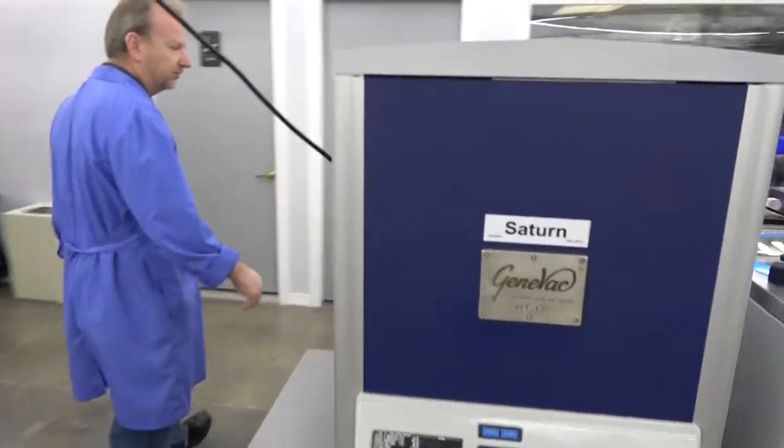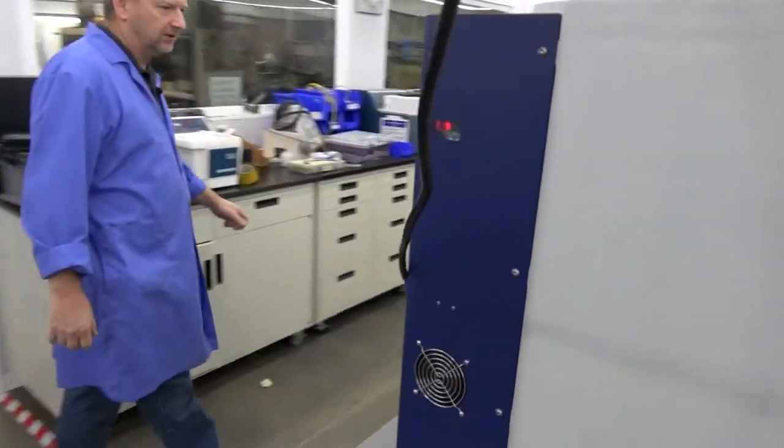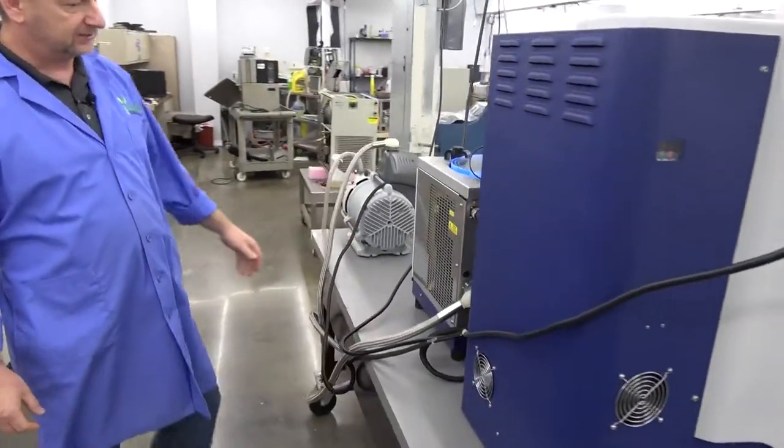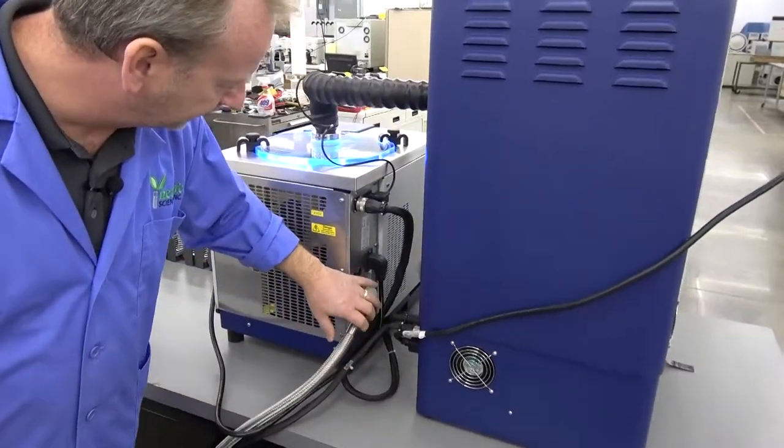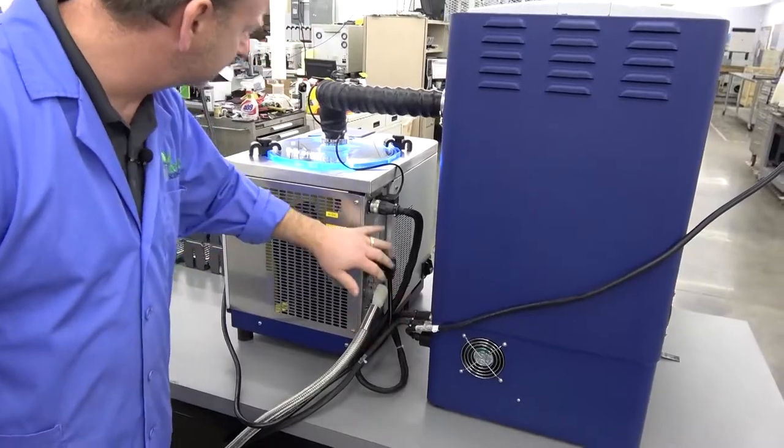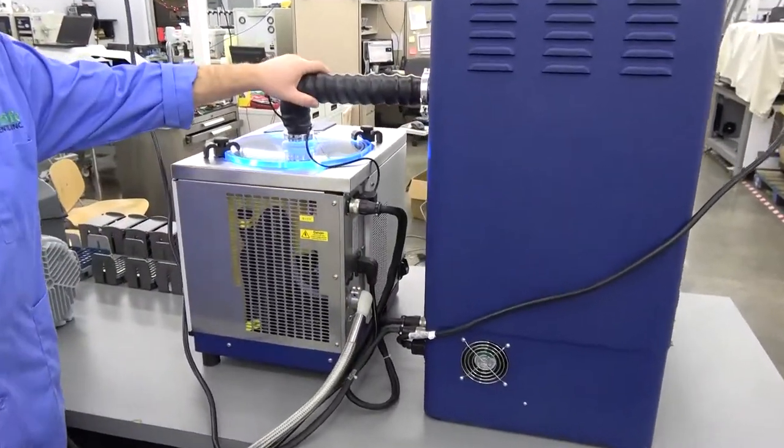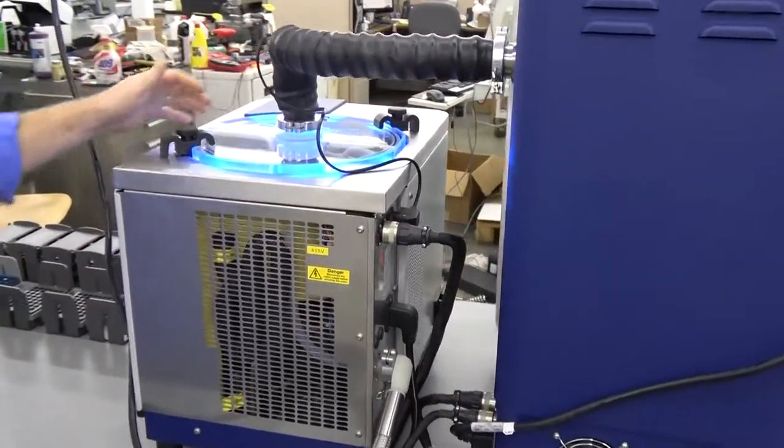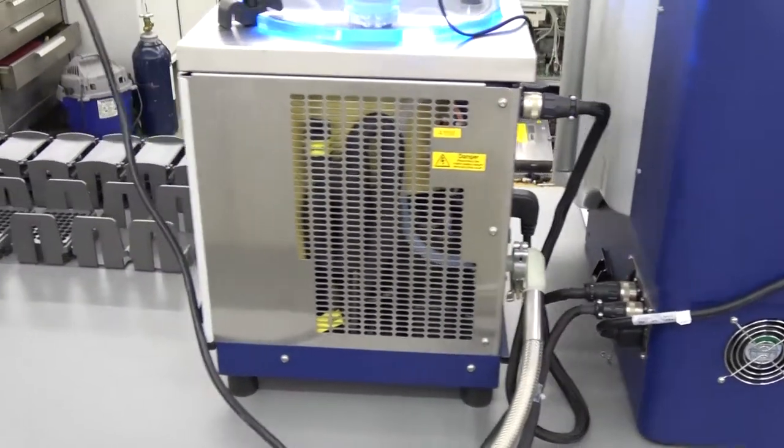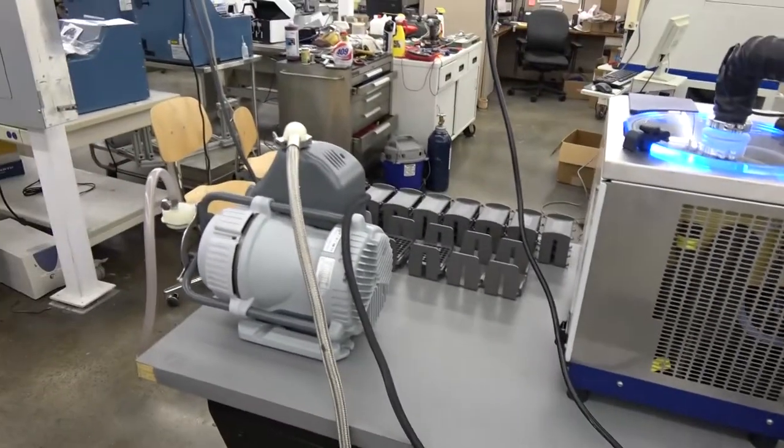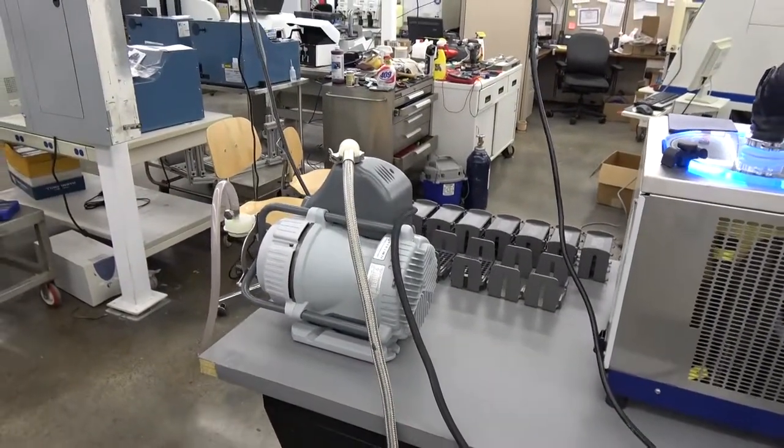We're going to take a walk around back here real quick just to show you the backyard that we're not hiding anything. Everything is complete. Just immaculate condition. Got all the cords, the hoses. Everything's working. The heated hose is working nice. Just like I said, just beautiful condition. Just a turnkey unit here.